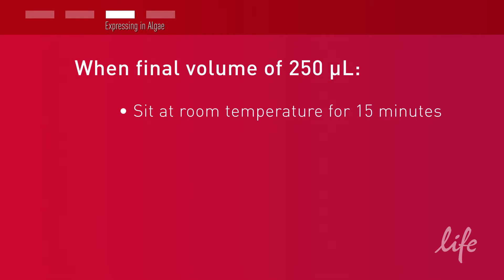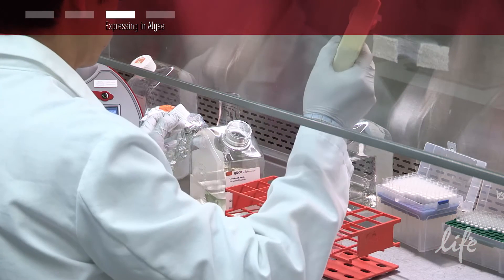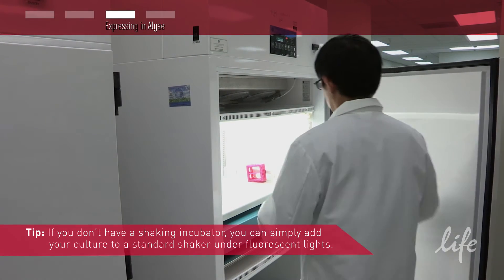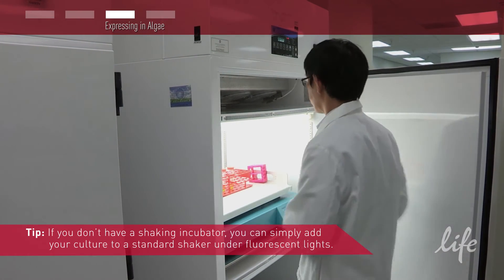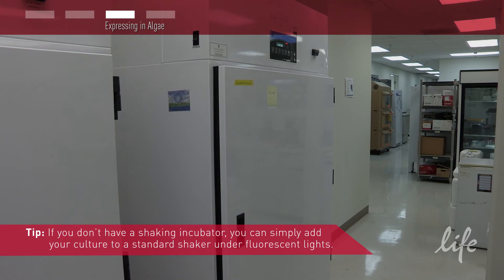When you have a final volume of 250 microliters of transfected cells, allow this to sit at room temperature for 15 minutes. Now add 4 ml of recovery media. Next, transfer the cells to the shaking incubator overnight at 50 microeinsteins, 25 to 28 degrees Celsius at 110 RPM.